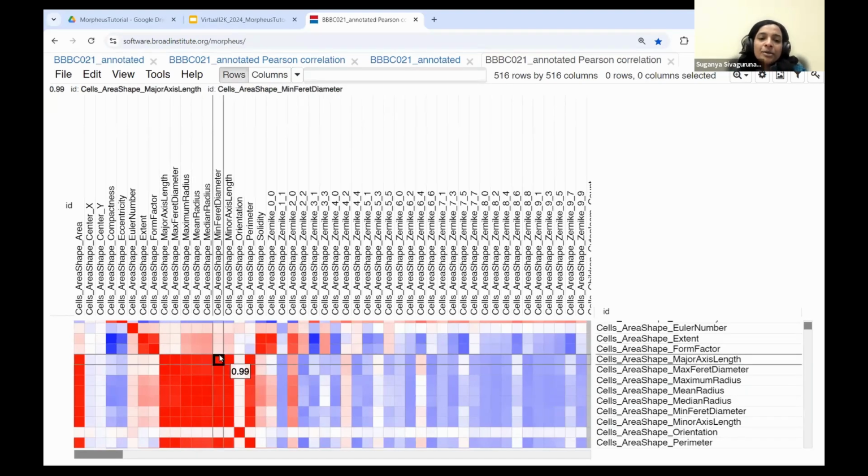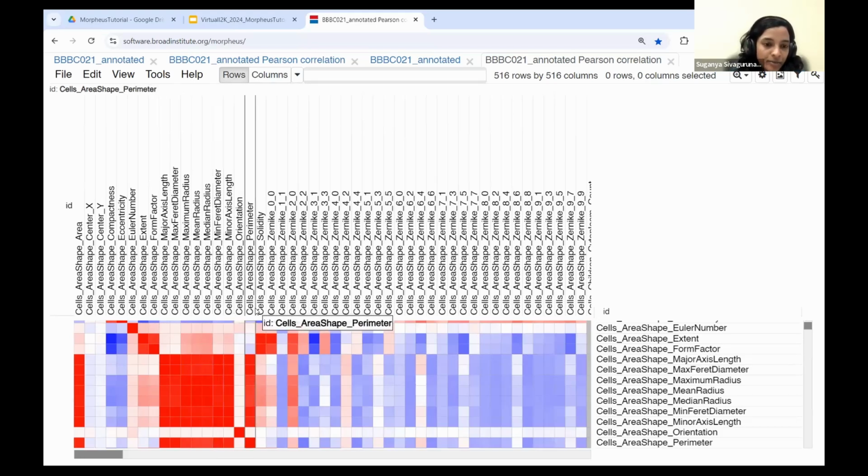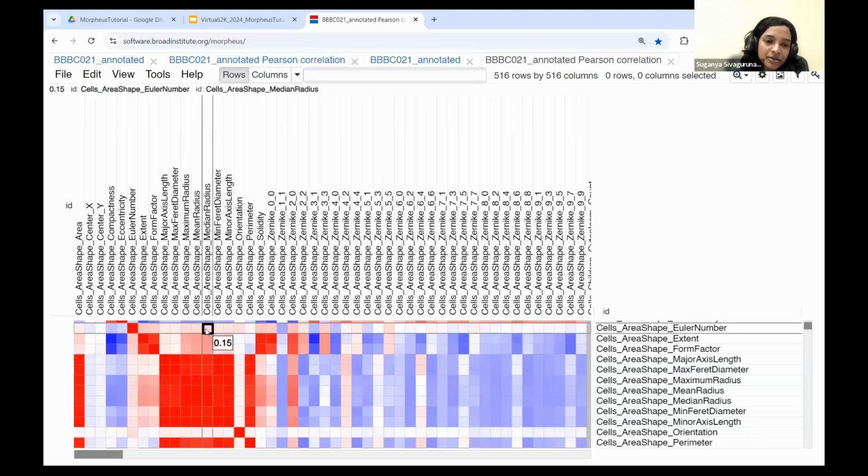So when you have all these features in and you're making a similarity matrix, this would have an additive effect when you're doing a correlation, which we actually don't want because this will not reflect the biology that's going on behind, but rather all of these features would be dominating and would make the associations not the right way to be interpreted. So what we would like to do is eliminate all the redundant features that you have in your data set.